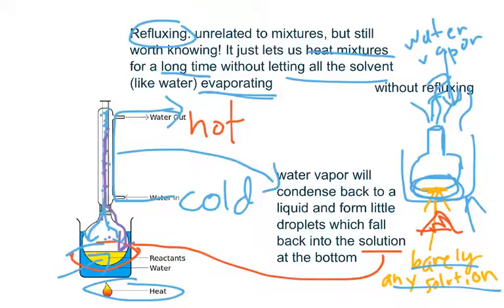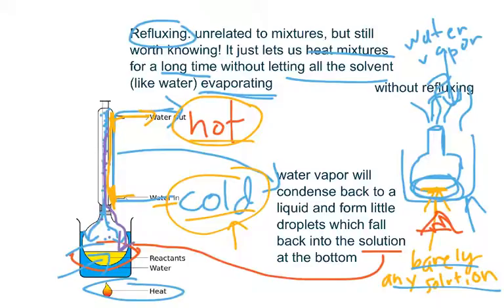So now let me ask you one question. Why did I write hot and cold? Why is the water over here cold while the water up here hot? Well, if you think about it, the water that's going in is coming from a really cold source of water. So, it will be cold. And as the water travels up the tube, it'll leave out here warmer than it was down here, because when it was moving up this tube, it's actually cooling down the hot water vapor.